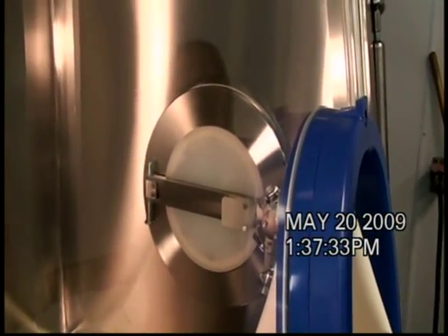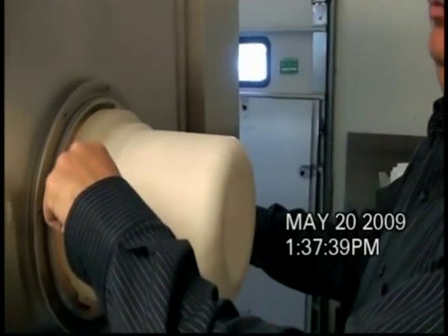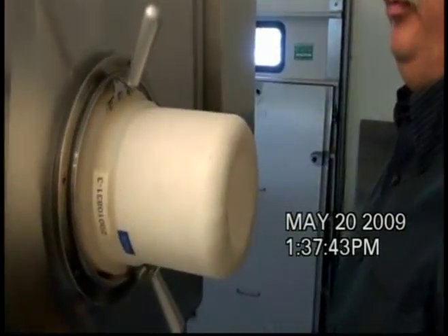From the inside of the isolator, you get a view of the alpha door. The container will be docked to the alpha flange, lining up the tabs and the slots. A 60-degree rotation locks it all in place.